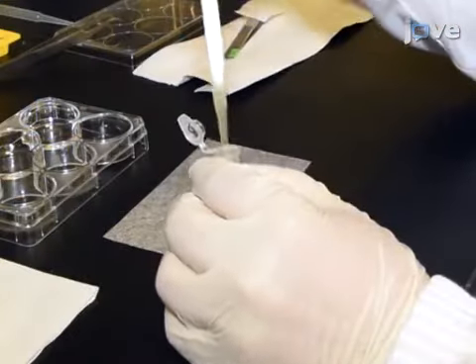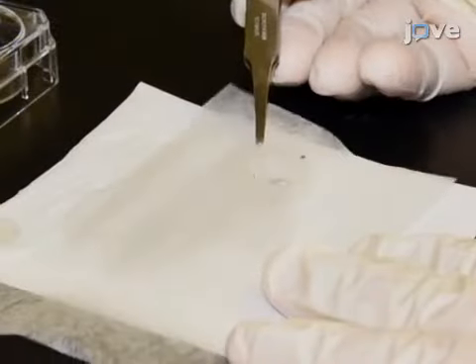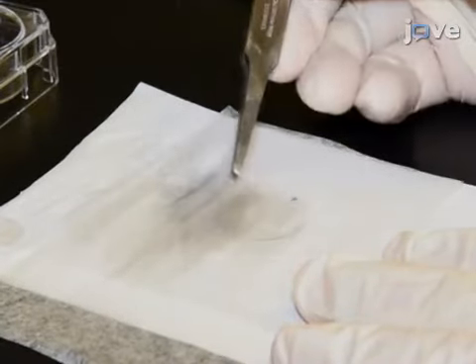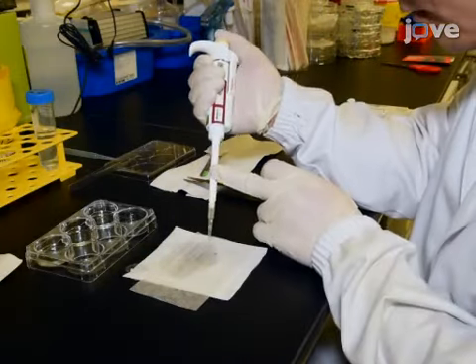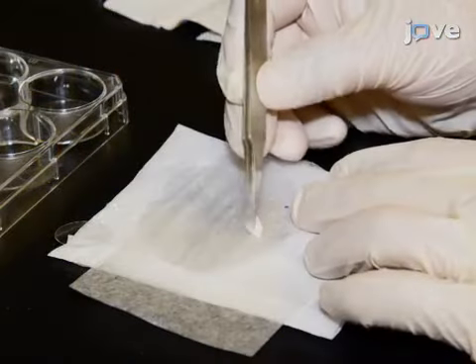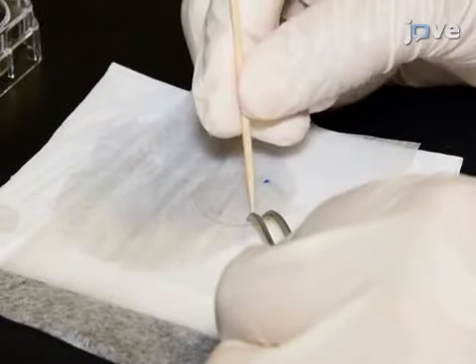Rinse the sample by placing 30 to 50 microliters of the imaging buffer onto the sample. Remove excess buffer by tilting and tapping with folded absorbent paper. After repeating the rinsing step a few times, place 30 to 50 microliters of imaging buffer onto the sample. Blot dry the edge of the cover glass and place multiple, very small dots of fast-curing epoxy onto the dried area.